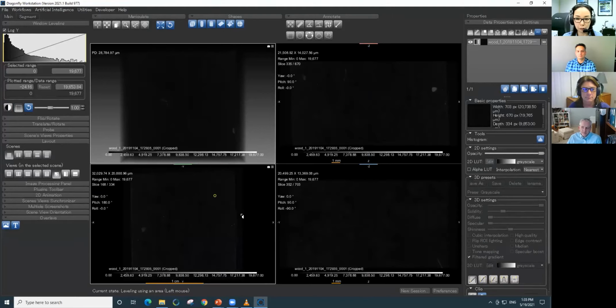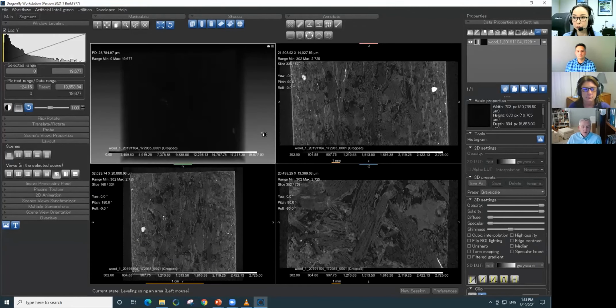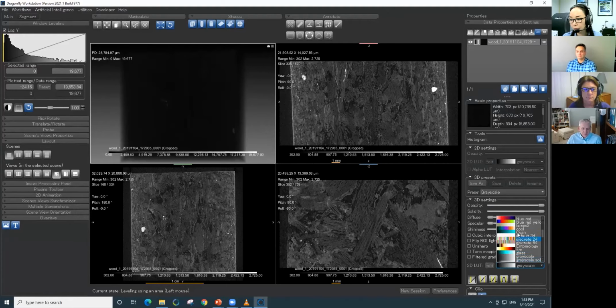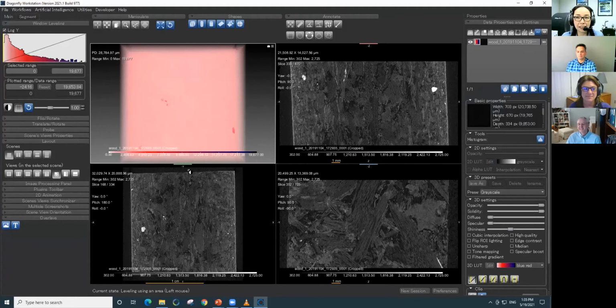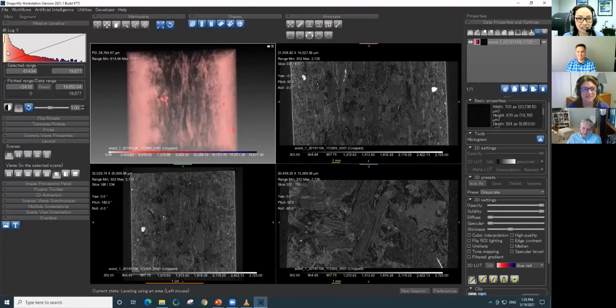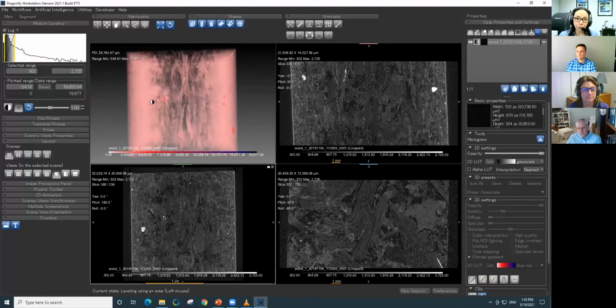It's all dark. Well, let me adjust this. There you go. This looks a little bit better. Let me color this too. So this is just a wood frame of a picture frame, or to be honest, this is something I found in a dumpster at work. And I think it's a piece of furniture coming from somebody's office. But nonetheless, I thought it was an interesting sample to scan. Okay, so let me get those lines.